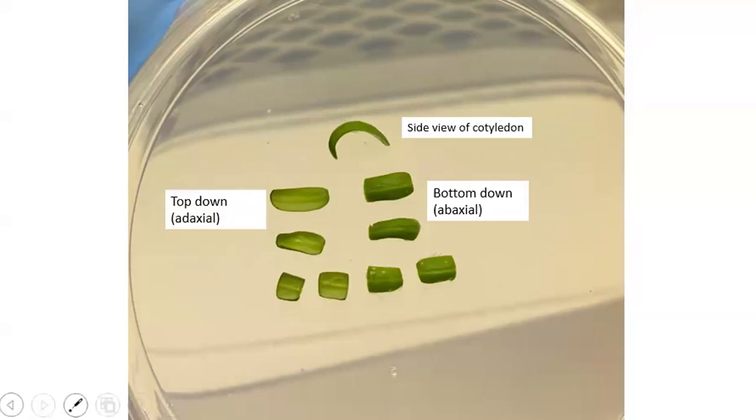So Joyce and Carrie, there were a couple of questions in the chat related to applying this protocol to other species or other tomato varieties, so I'll group those together. The first question was from Billy: how translatable is this protocol to other similar genus like Physalis? And another question from Diego: are there significant differences in transformation efficiency between the tomato cultivars?